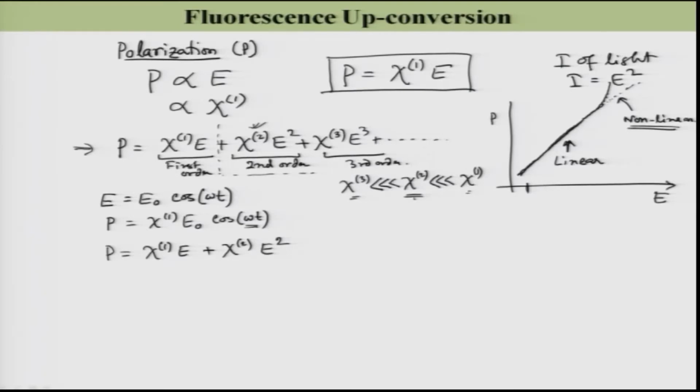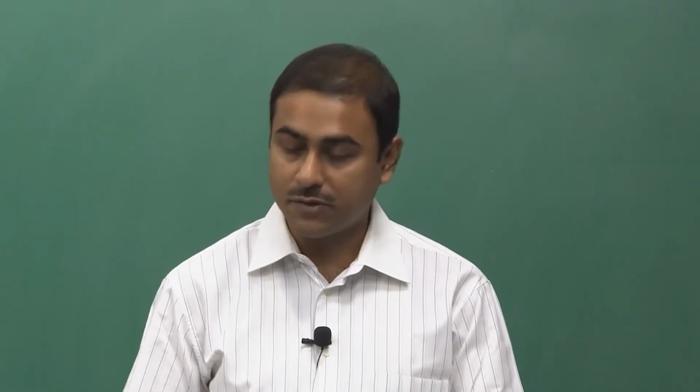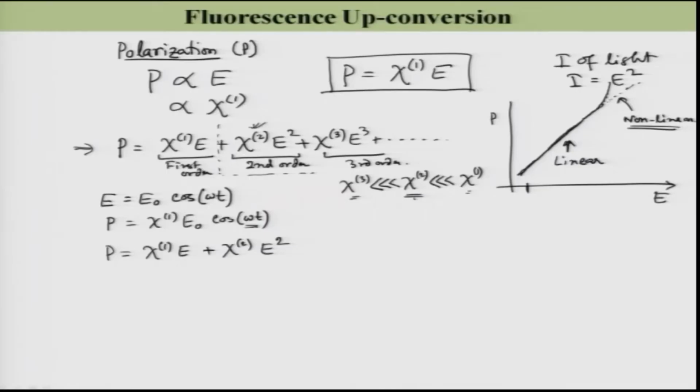And this kind of effect is only visible when the power of the light is very high, which is the case for the laser. Otherwise, for normal light, such kind of nonlinear effect is not visible. But with the laser, as I mentioned briefly, one of the properties of the laser is that it has a very high power, then only we will be able to see this nonlinear effect.